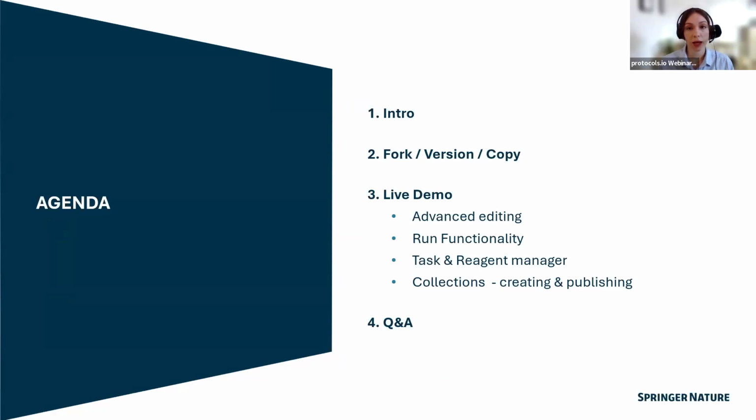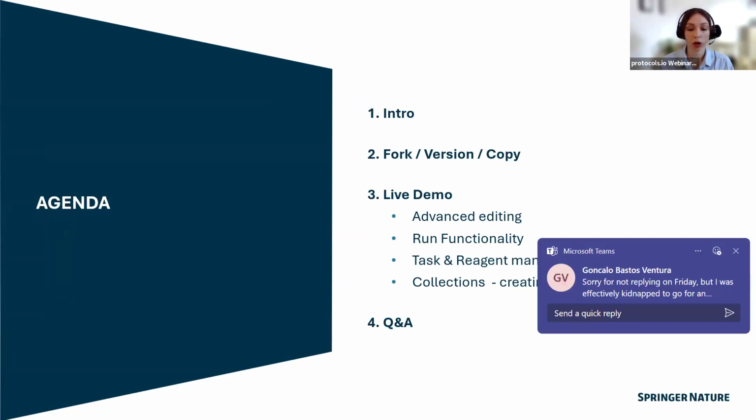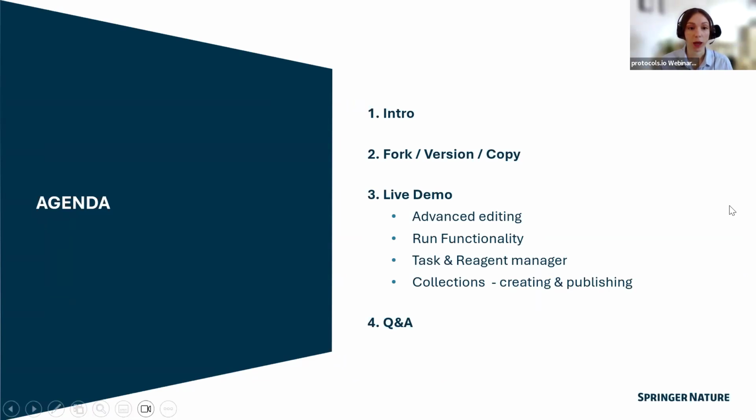So for the topics today, I'll give a very brief intro to Protocols.io. I'll talk about some of the functionality and nomenclature in terms of forking, versioning, and copying. Then I'll hop out of the slides into the platform, and it will be a live demo of some advanced editing, how to use the run feature, the task and reagent manager, and collections.